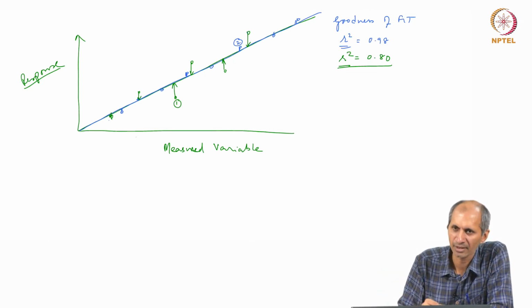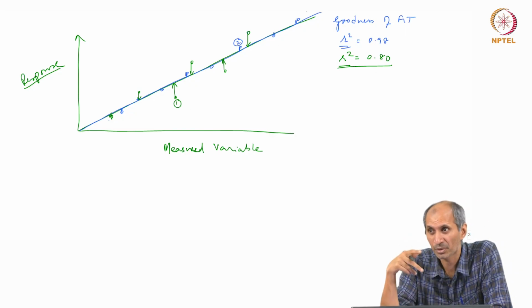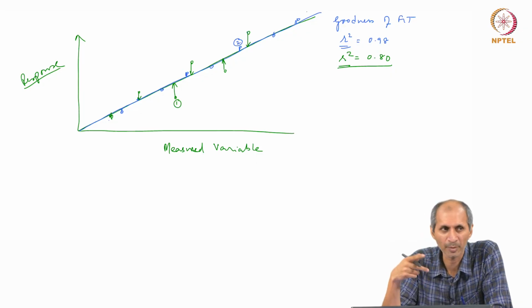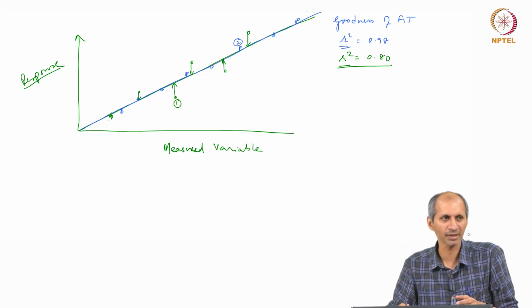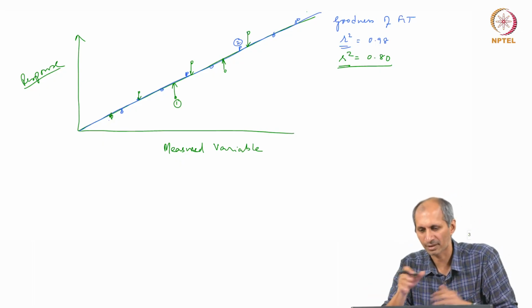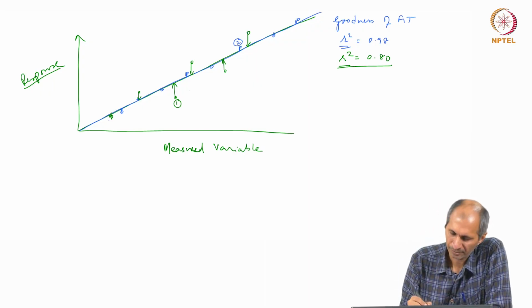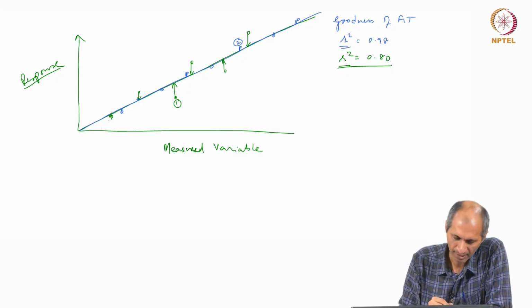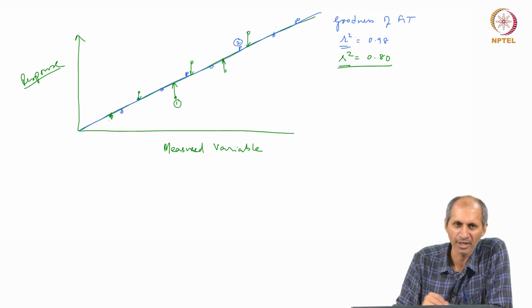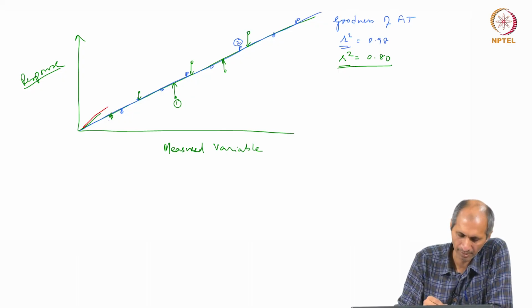If you have the green points, then usually we do not like it, unless that is a limit of the system itself, where nobody is able to get any better than this. Then that is fine, that is the maximum you can get, and you have to work with it, there is no other way of doing it, okay. That is one. The second is that this response curve itself might change over a period of time, okay. So, sometimes this may happen, sometimes this may happen.